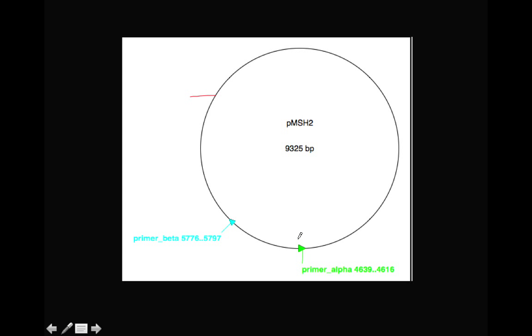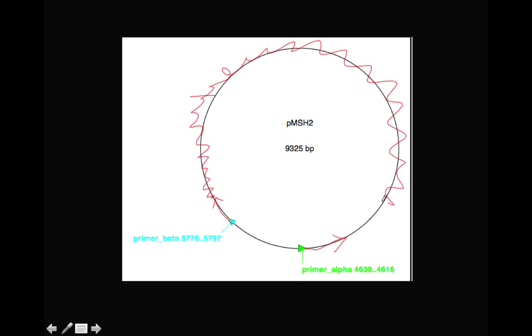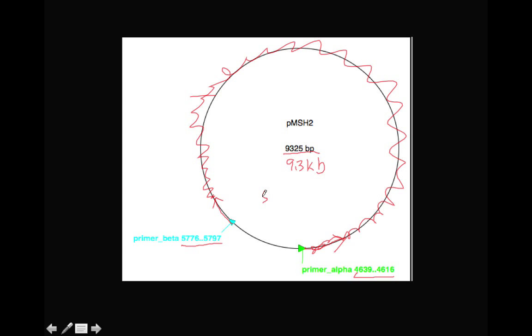If primer alpha is going to go this direction, primer beta goes the other direction. The arrow indicates that direction. So the PCR product is basically this part of the plasmid. And we just need to estimate the size of this PCR product. We know the size of this plasmid is 9.3 KB.